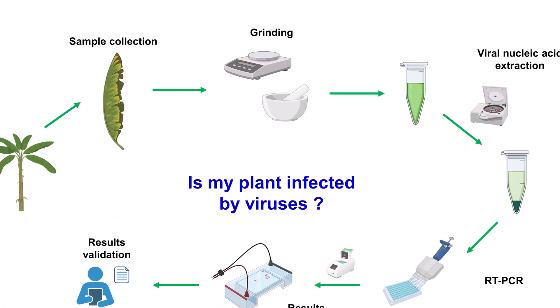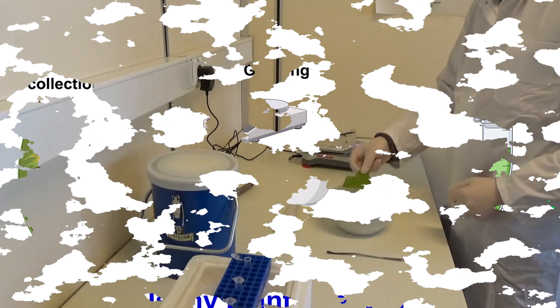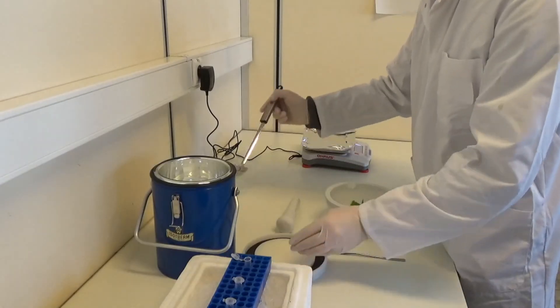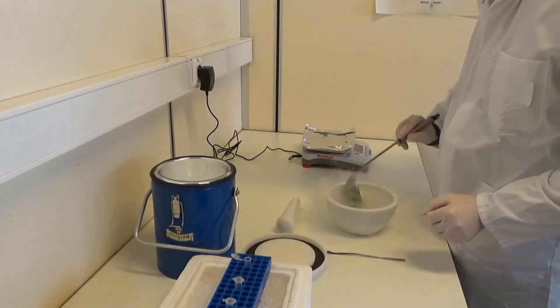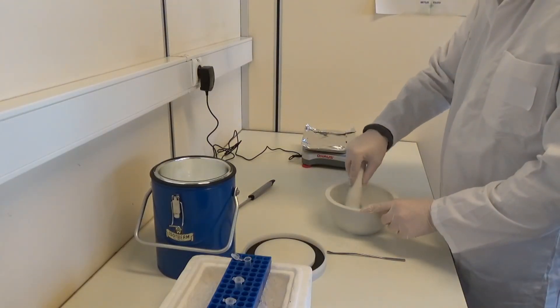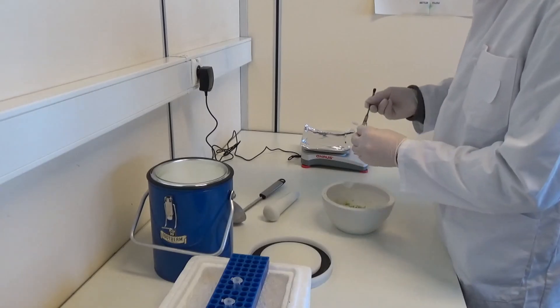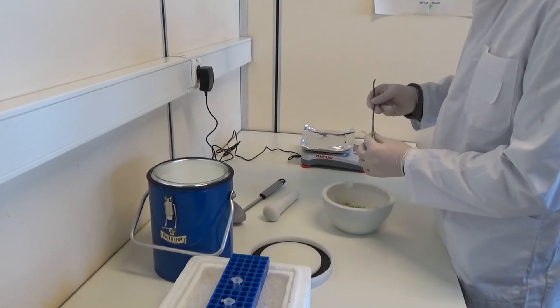The next step is sample preparation and grinding. Depending on the virus to be tested, samples are ground using different methods: either in a mash bag with a special grinding buffer and ground with a homogenizer, or the samples can be ground with mortar and pestle. The resulting powder is weighed and transferred to the extraction tube for the next step.